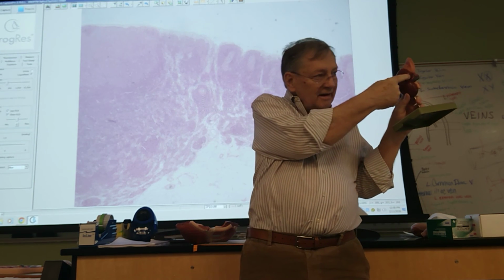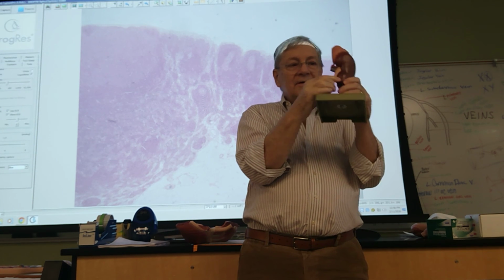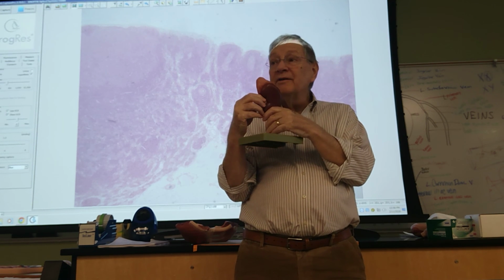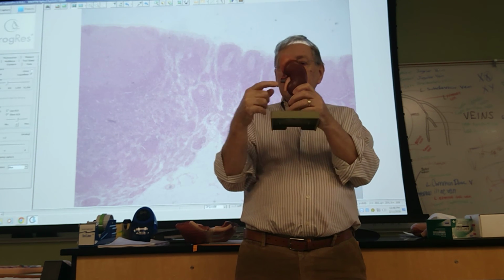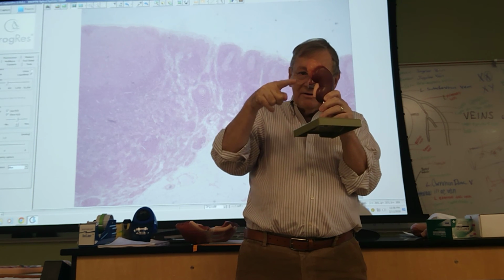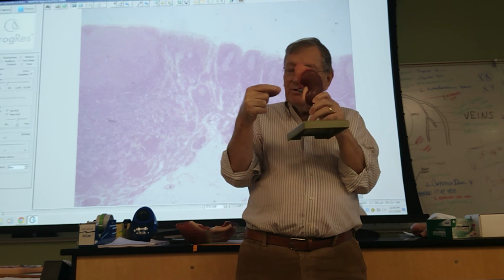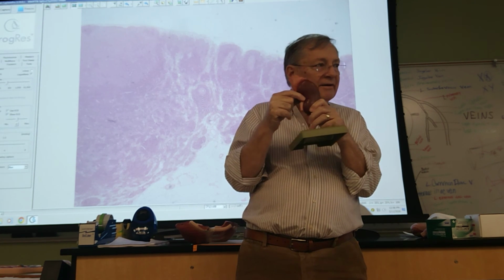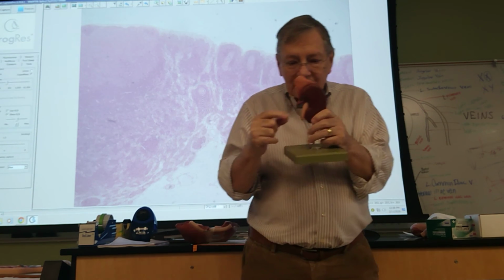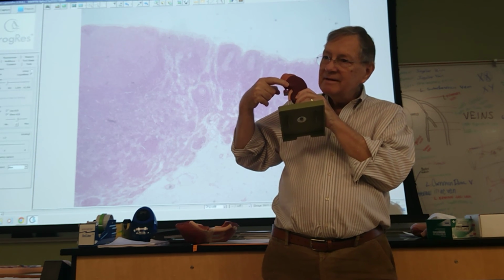So it's like an indentation. Okay? So here's your kidney. We'll find hilus or hilum in a variety of other situations. Okay? So it's just an area, like an indentation, where larger vessels go in and out. You often see a lot of adipose in that area too. Not always, but often. Okay? So this is, see how it's indented there?